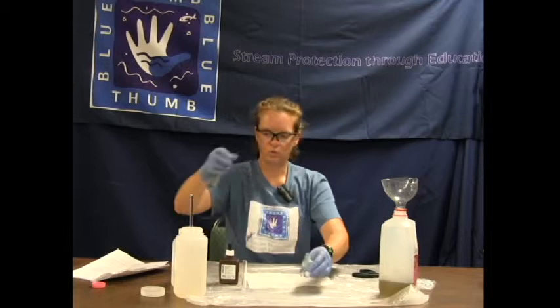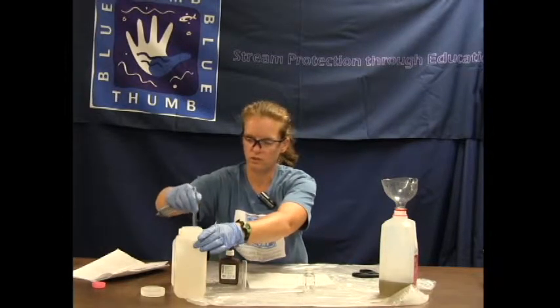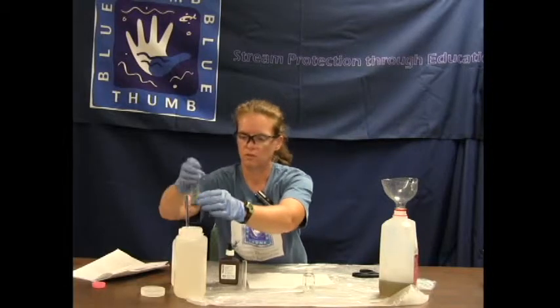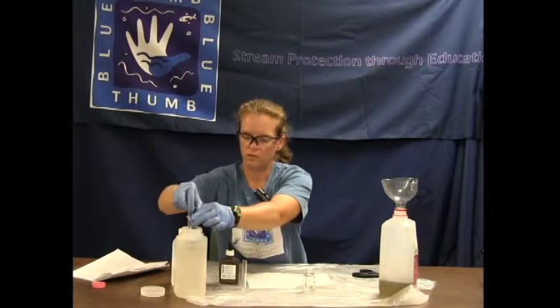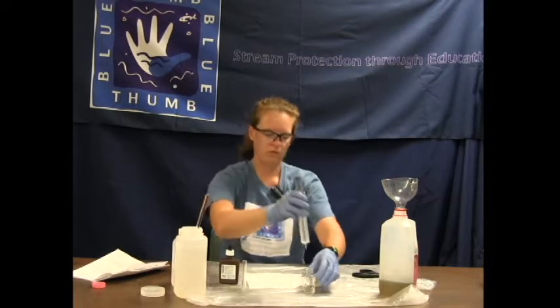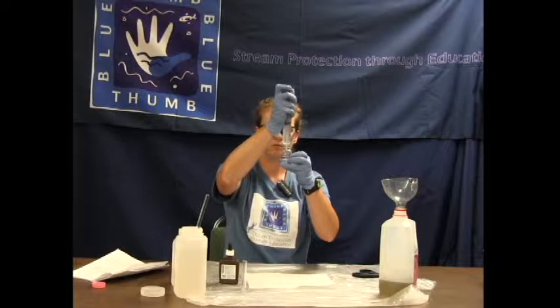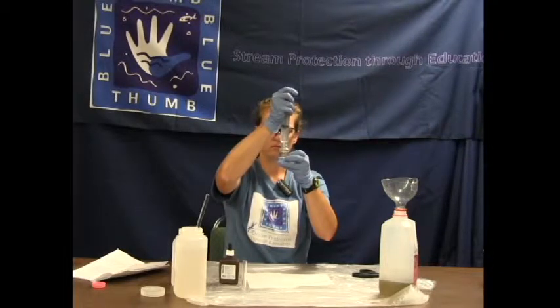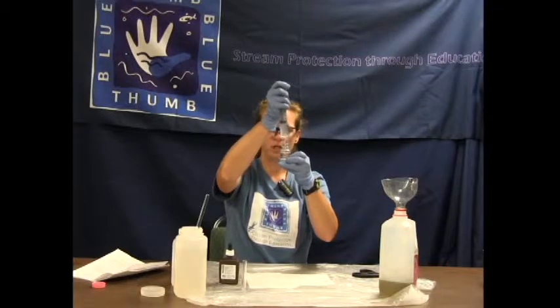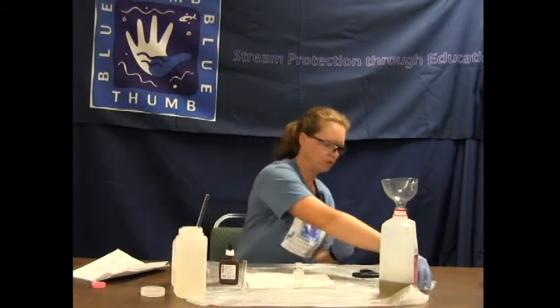Fill the bottle with creek water to the 23 line. I need to get some more water in my syringe — always stir the water before you pull it out. Fill to the 23 line with creek water so that the very bottom of the meniscus curve touches the 23 line.